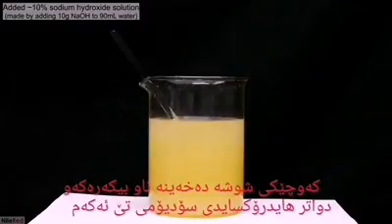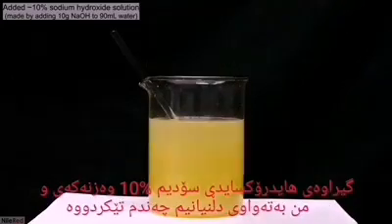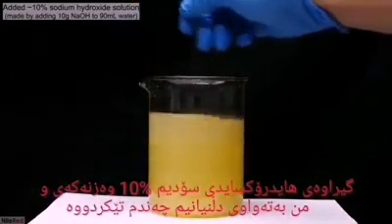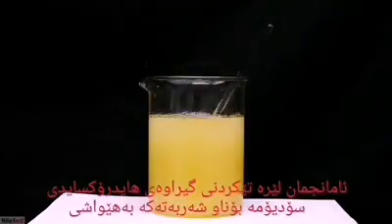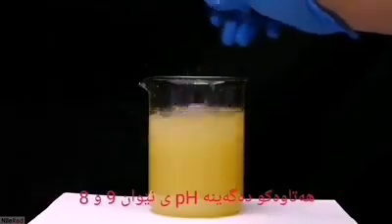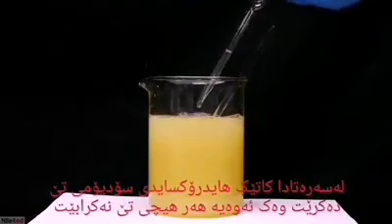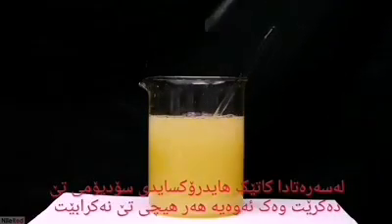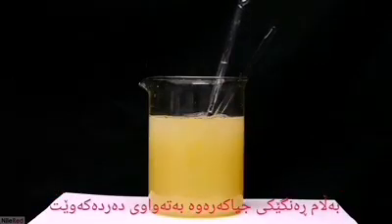A glass stir rod is added to the beaker, and then I start to add sodium hydroxide solution. The sodium hydroxide solution is 10% by weight. The goal here is to add the sodium hydroxide solution slowly until we reach a pH of about 8 or 9. Initially, when the sodium hydroxide is added, it won't look like too much is happening, but a very distinct color change will eventually occur.